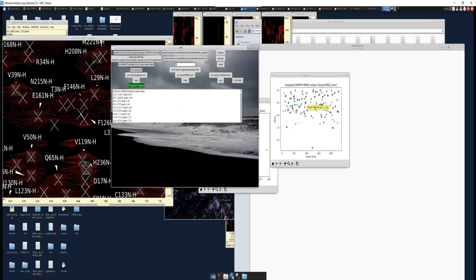You get a whole table of matches. However, you'll notice that there is one match that stands out from all the rest, and that is that 124 to 126 phenylalanine. So while the BMRB approach is less stringent, if you have at least 3 amino acids within a row, it can be used just like the Sparta Plus can.